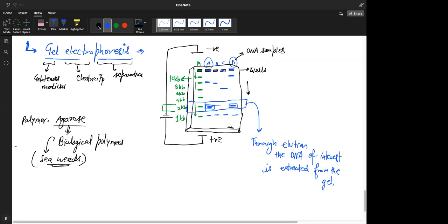Okay. So write down DNA staining. Do we stain all of them? Yes, we stain the whole sample, like everything. That's why we can see that different fragments are present. So DNA staining can be done.